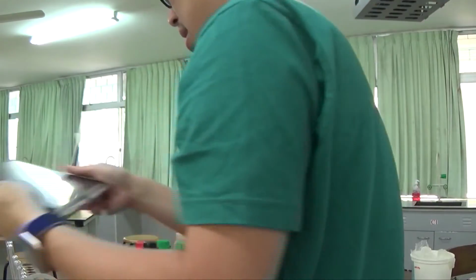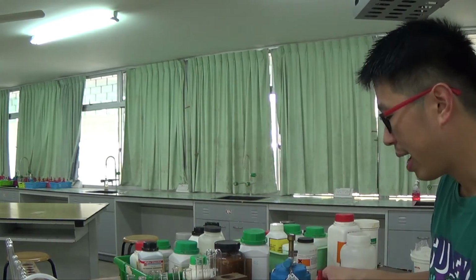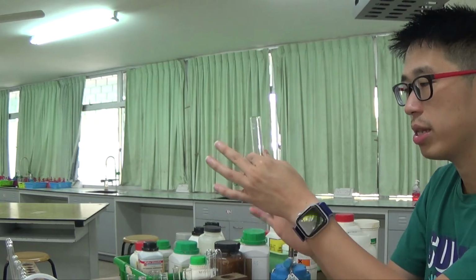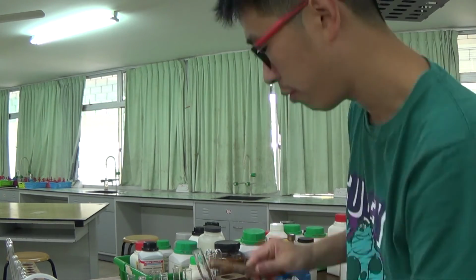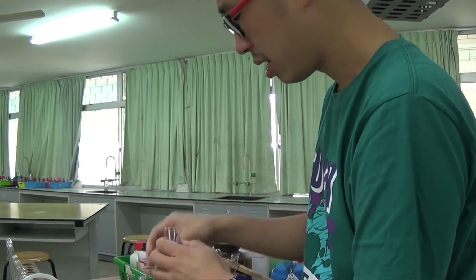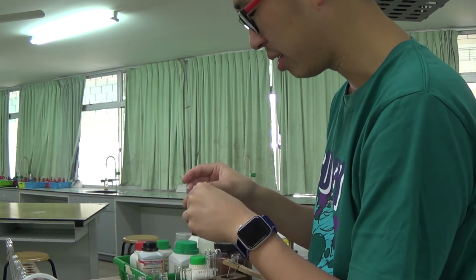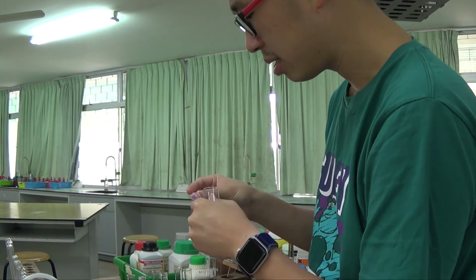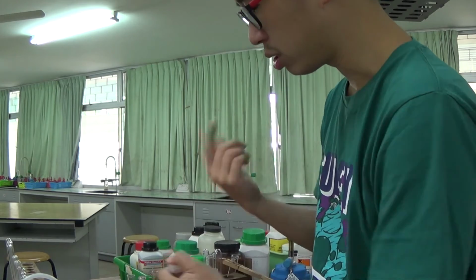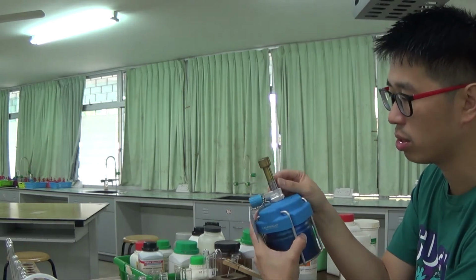Anyway, I should test for the other cations. I added excess sodium hydroxide just now, right? And then I get a clear solution. So this is in excess sodium hydroxide. I should test for the ammonium ions, because when you add excess sodium hydroxide, you should always test for ammonium ions. If they tell you that there is another ion present, and if it is not colored, you should always keep an eye out for ammonium ions. The test for ammonium ions is not that difficult, but you need to know what to test for.